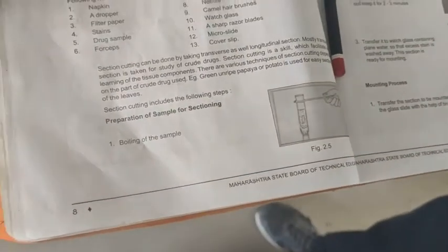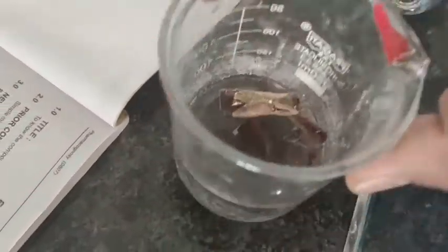Therefore, the first step is that you have to take these samples, and boiling is the first step. You have to take the sample into the beaker, then boil the sample.